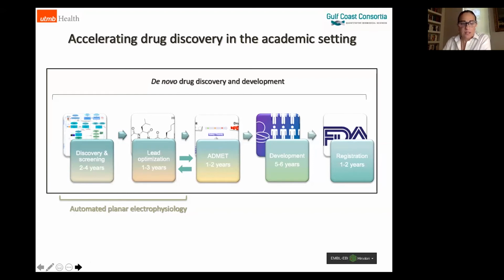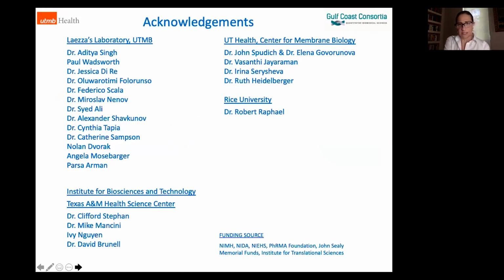So I think it is extremely important that companies like Nanion are able to dialogue with us, with academicians, and introduce us to your amazing technology. I think it's going to be a different era in terms of drug discovery and drug development, especially for ion channels, with the advent of automated planar electrophysiology, and fortunately and finally its arrival in the academic setting. And this is my acknowledgement.